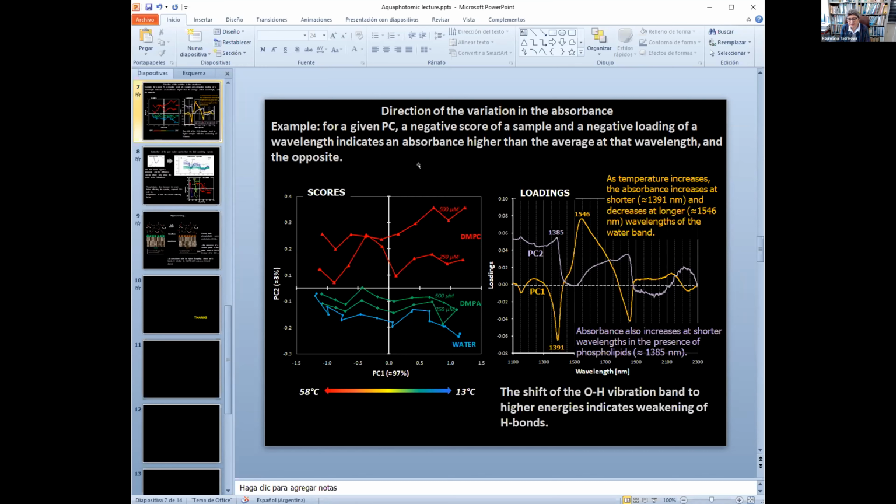And also, from my side, I would say 1391 is a dehydration band, or we call it trapped water. So it means that this is the water that goes in between the lipids. It is beautifully seen here. So I was so happy to see this. But I don't know how we can, maybe Disalvo can help us with this protonation stuff, because obviously something is happening to the protonation. Maybe Elena knows more, do you remember something about 1546?